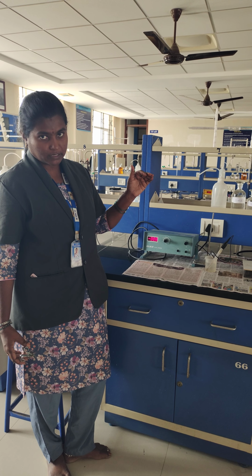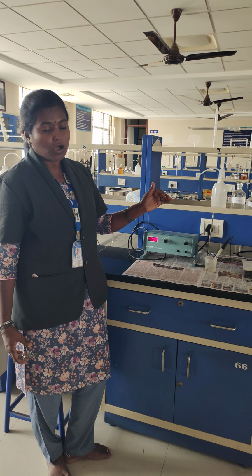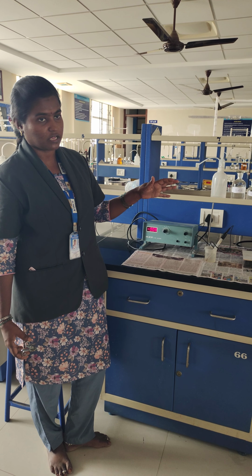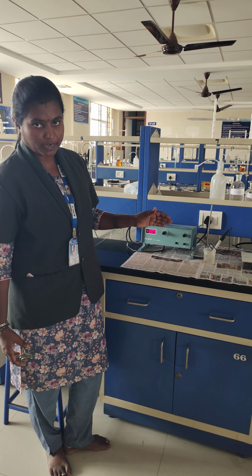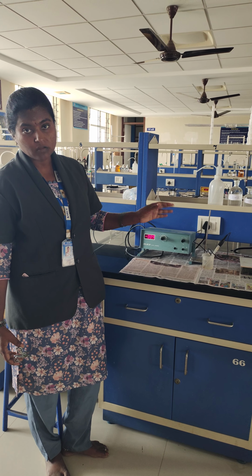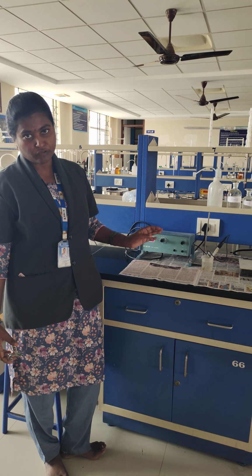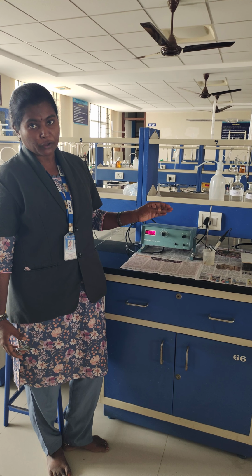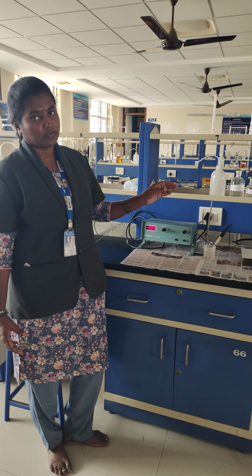After getting that sudden increase, just add 5 to 6 ml of sodium hydroxide, then stop the experiment. Then we have to plot a graph between the volume of sodium hydroxide and the pH value. From that graph we can get the exact amount of sodium hydroxide required for neutralizing the given HCl.